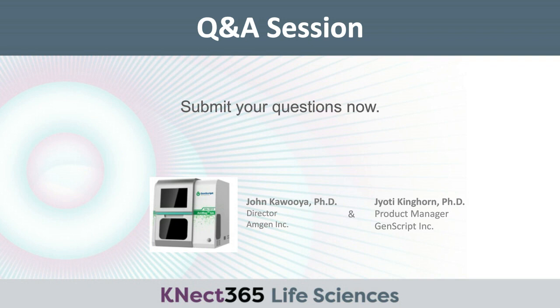All right, great. So the next question we have here: I know that 18 to 24 hours doesn't hurt viability or quality, but do you need that much time for full recovery? And what recovery would you see at 1, 2, 4, 6, 16 hours, et cetera? Also, three-parter here, what brand of beads were used for the quality validation studies?